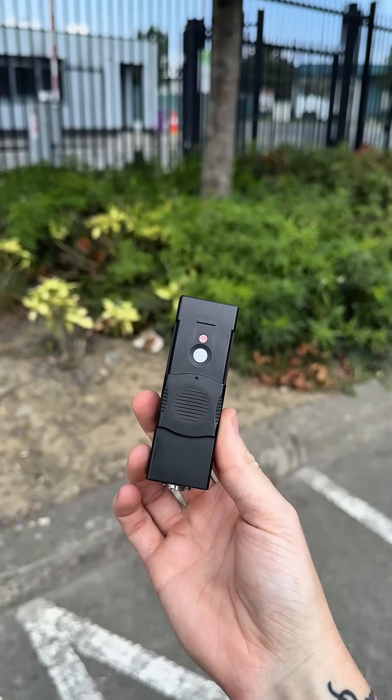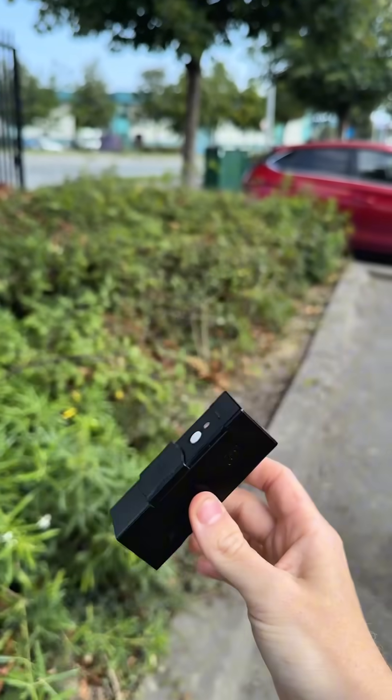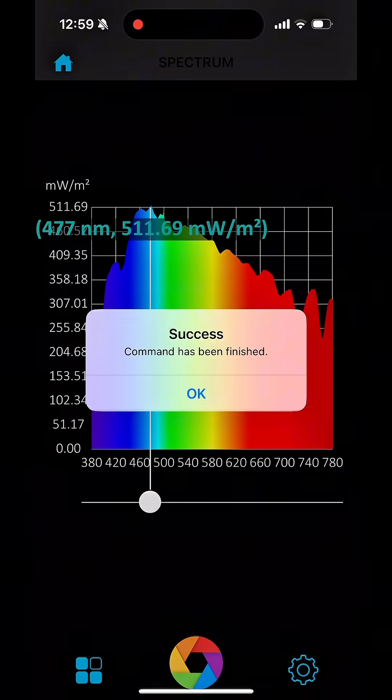Why does Far Red make plants stretch? We're going to use this Apogee Spectral Radiometer to tell you exactly why. We are currently taking a baseline reading to show you what the normal spectrum is like of the sun above a leaf.